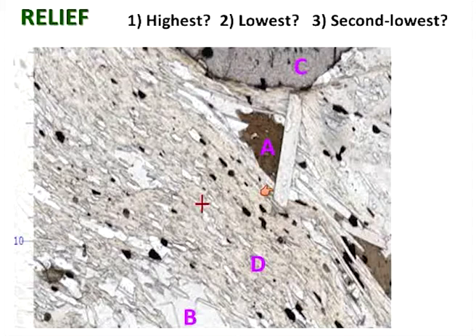But it is in fact higher relief biotite than muscovite. So although I think one or two of you might have thought, oh, hang on, the colour is kind of tricking me, and maybe it isn't actually as high relief as all that, in fact, biotite is slightly higher relief than the muscovite. I think what you're seeing here, in fact, is a sort of 3D effect. It looks a little blurred, doesn't it?